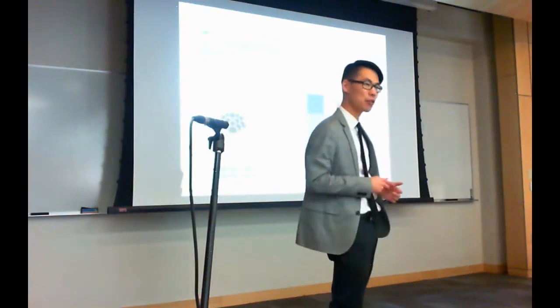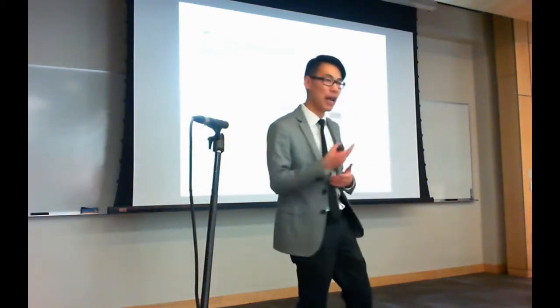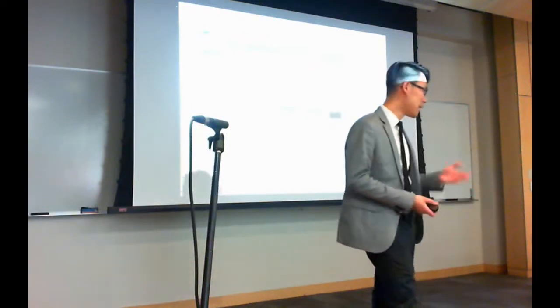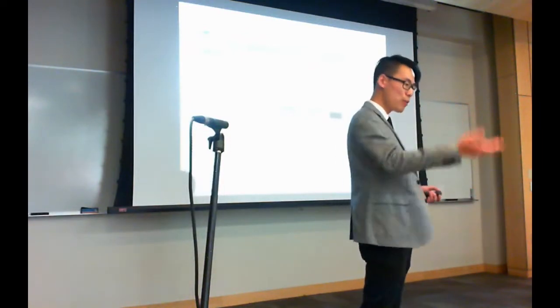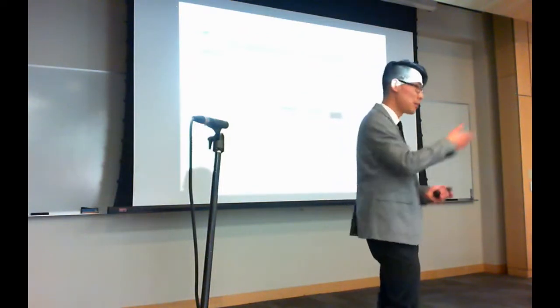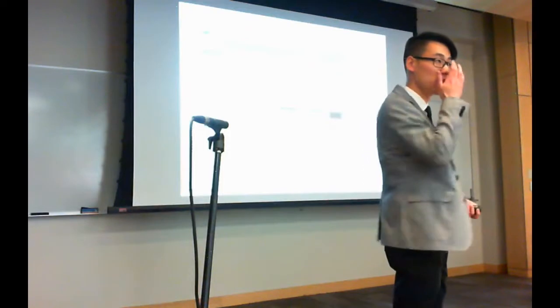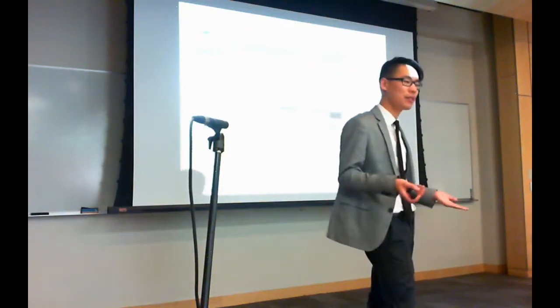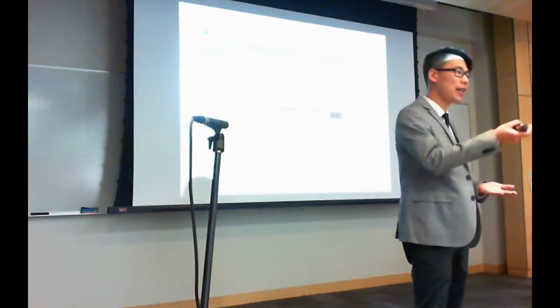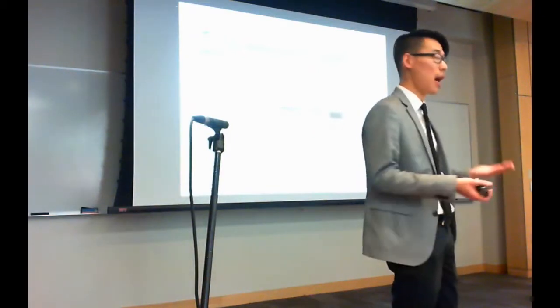And so now the next question is, how reliable are the spectra? And the way we started getting at this is, well, we make identifications with these libraries. If they don't make good identifications, that's cause for concern. And so when we make identifications, we ask users, was this right? And they can answer, yeah, it was correct. I'm unsure.